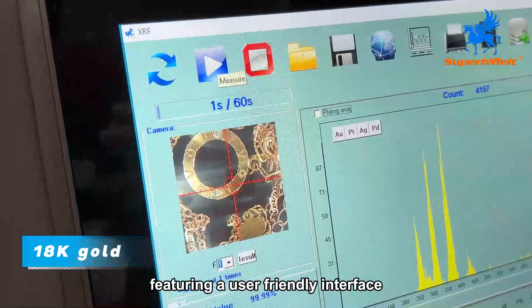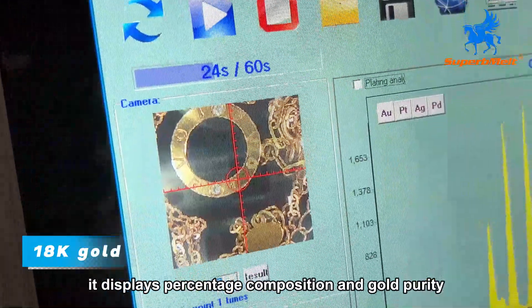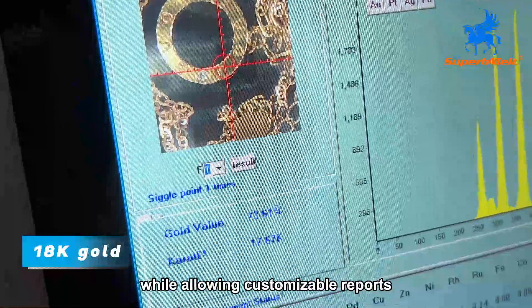Featuring a user-friendly interface, it displays percentage composition and gold purity while allowing customizable reports to meet client needs.